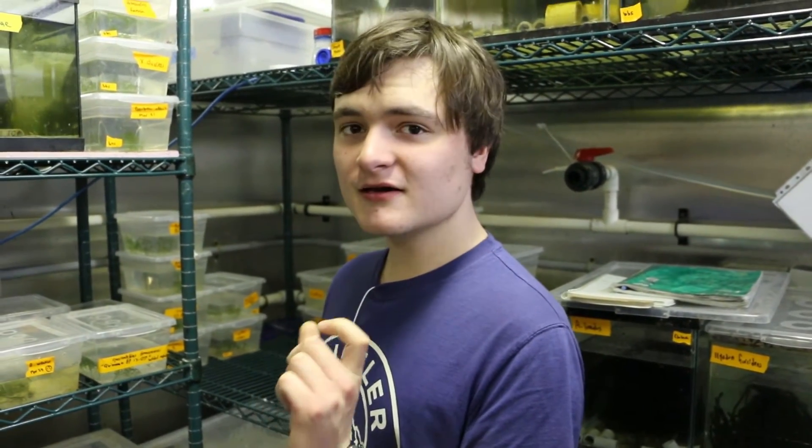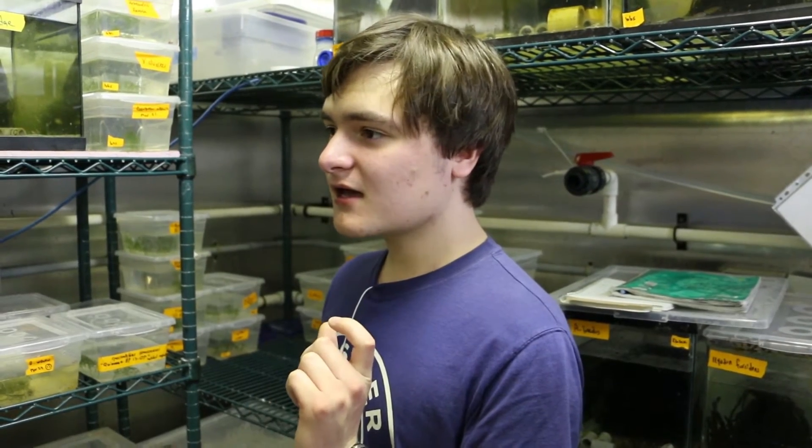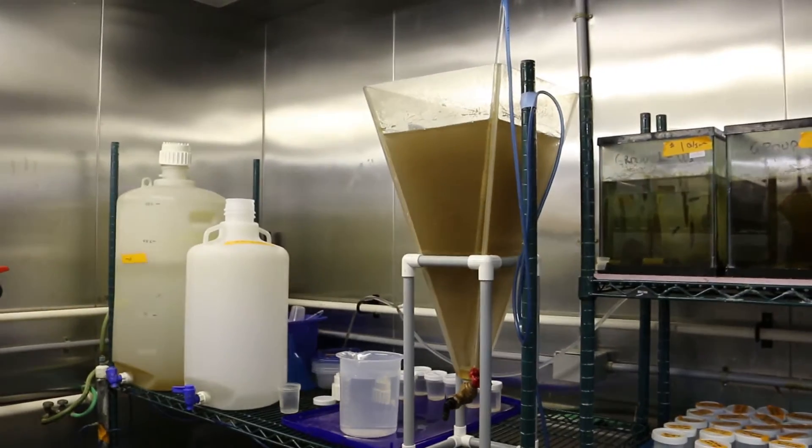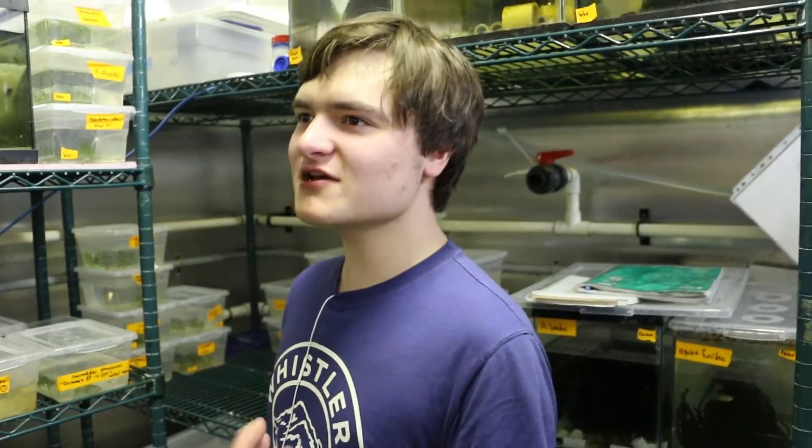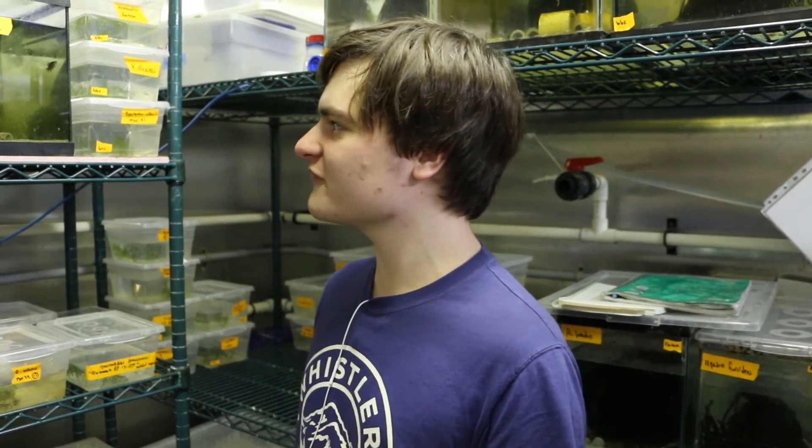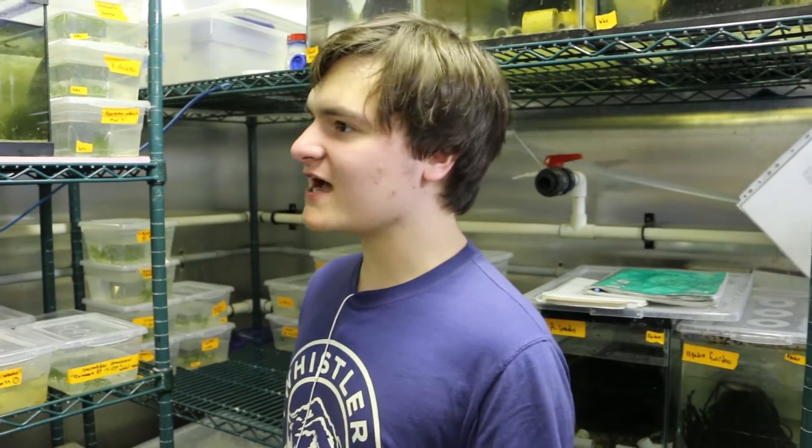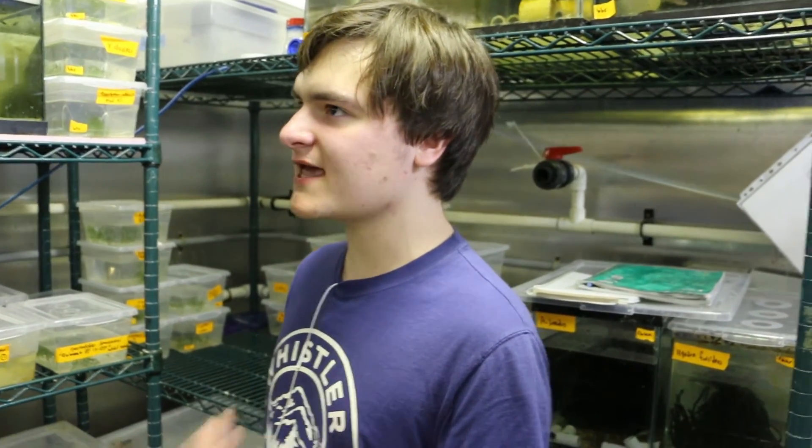And when they're very small, they need live food, very small live food. So we hatch out brine shrimp here at the killifish colony to feed the fish on a regular basis. And once they grew up big enough, they would be euthanized for various research, usually after they reached a certain age and had already spawned, because we always try to get them to breed first so that we can continue on the population in the killifish colony.